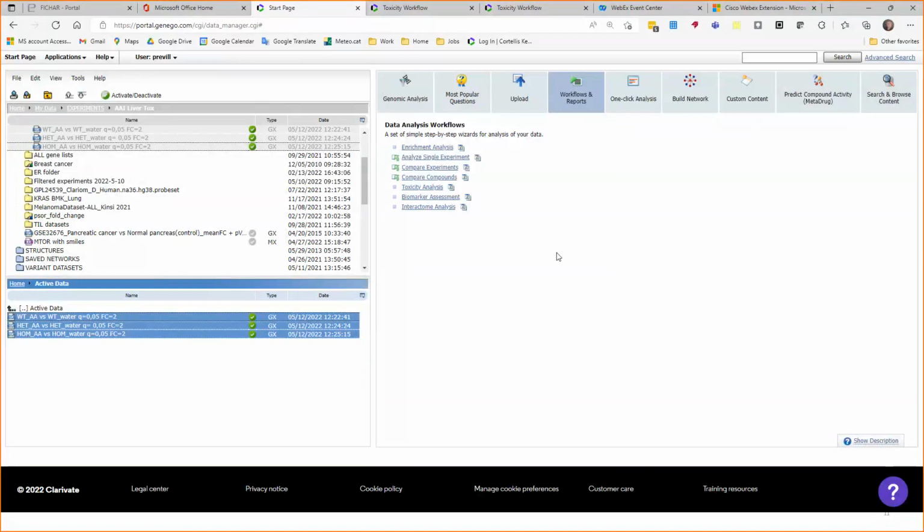So now I'm going to switch over to MetaCore, which is the tool we use to analyze the differentially expressed genes that Anne showed earlier when she separated them and passed over those folders that were in MetaCore ready format. So in order to start, I would come through to this upload workflow here. Over on the right-hand side, we have a toolbox, and over on the left-hand side, we have a space where I can store my data and activate it for analysis.